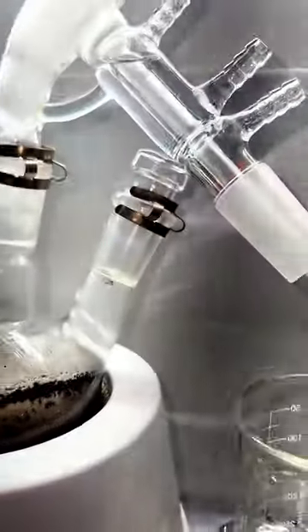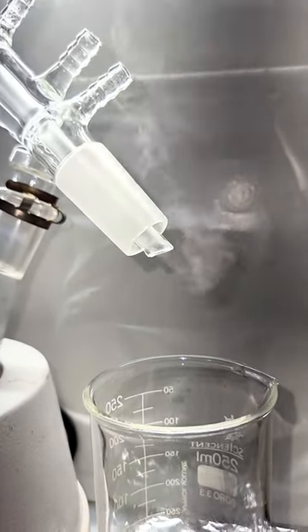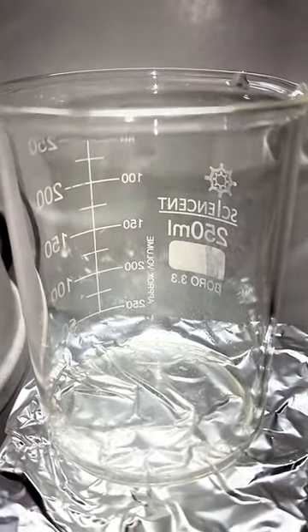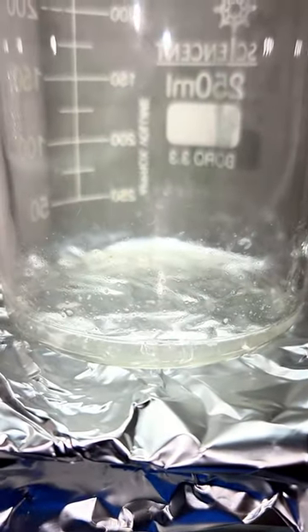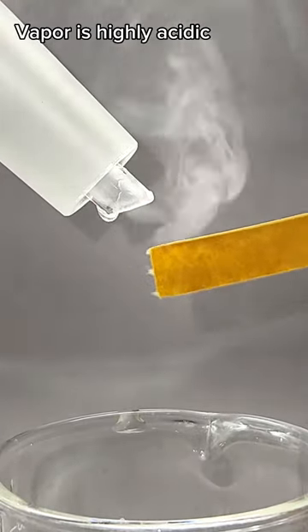I crank my heating mantle up as high as it'll go, and at around 300 degrees Celsius, a lot of water begins to boil away. Water is always going to be the primary contaminant in waste sulfuric acid, as sulfuric acid is mostly used to pull water out of things or to drive dehydration reactions.